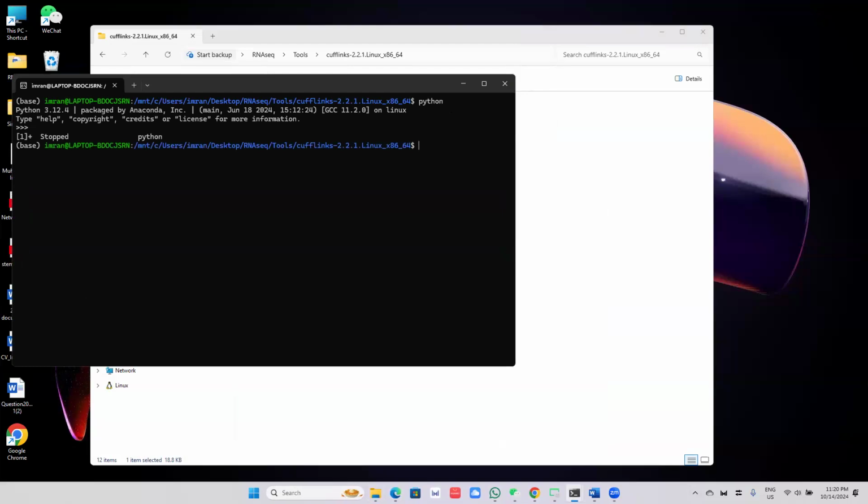I was trying to install Python 2. If I write conda activate Python 2, it changes the environment. But why have you created the environment in your system? I told you not to download Anaconda in the Windows system because it is not required. In the Windows system, we are already working on WSL. I told you Anaconda is for the Mac people.